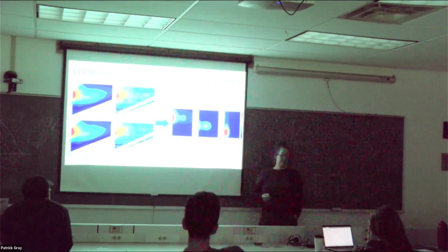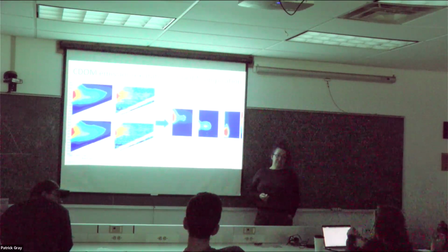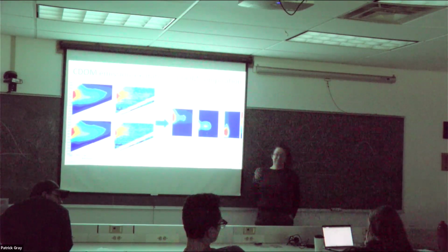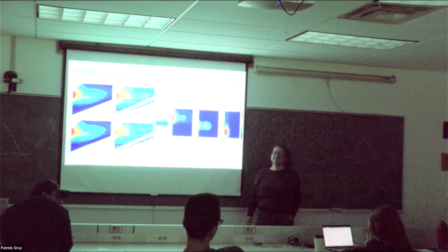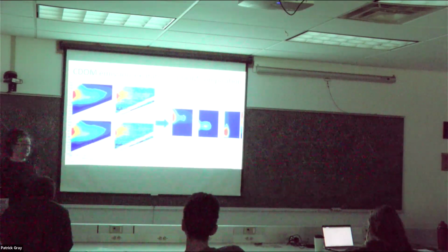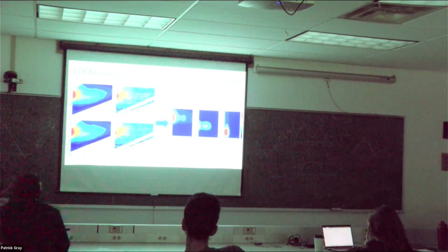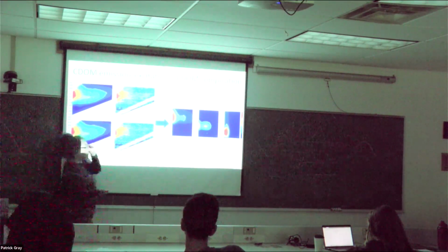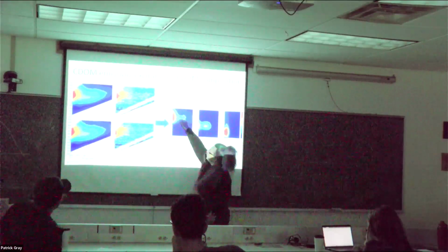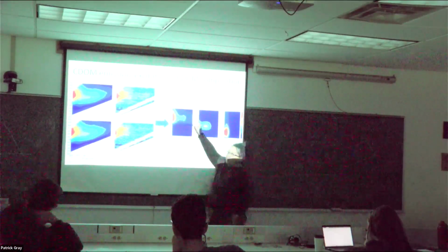In theory, if you have the same excitation wavelength, could you design an instrument that then senses at multiple wavelengths, so you can characterize it all at the same time? Yes, and there are ECO sensors that do something like that. You just have to have a very narrow detection window to not get the leakage, because you see how close these are.